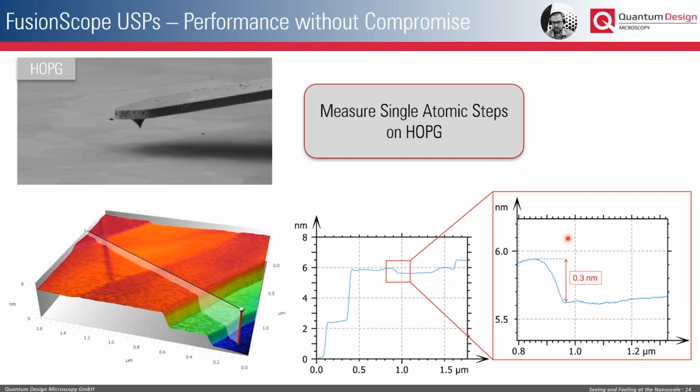So we easily can observe single atomic steps since we have a noise level in the AFM of around 50 to 60 picometers.